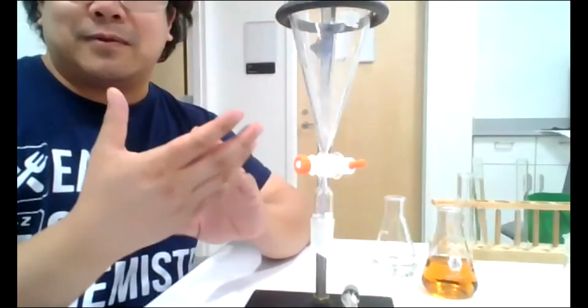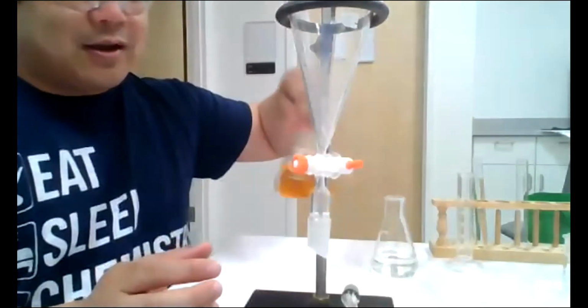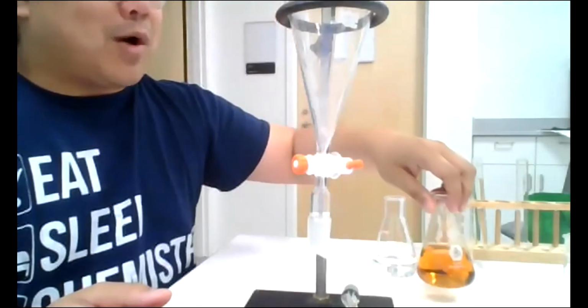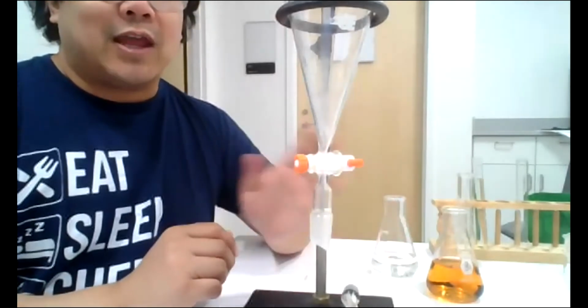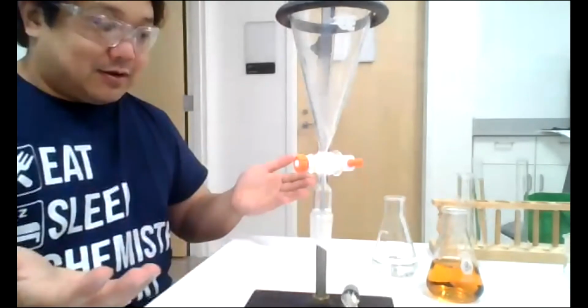Okay, sometimes I say washing because really what we're doing is we're washing, right? We're washing the aqueous layer and getting rid of these impurities, the iodine. So washing is still a valid term in this case. And we're washing the iodine or the aqueous layer twice. Okay, let me show you how that's done.